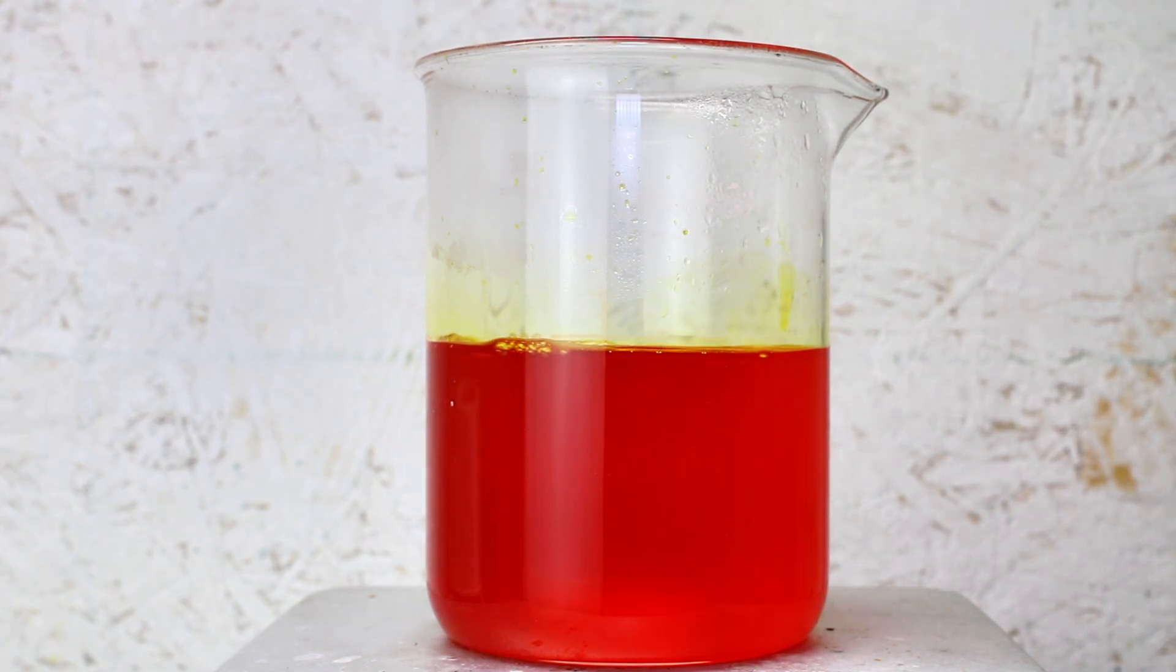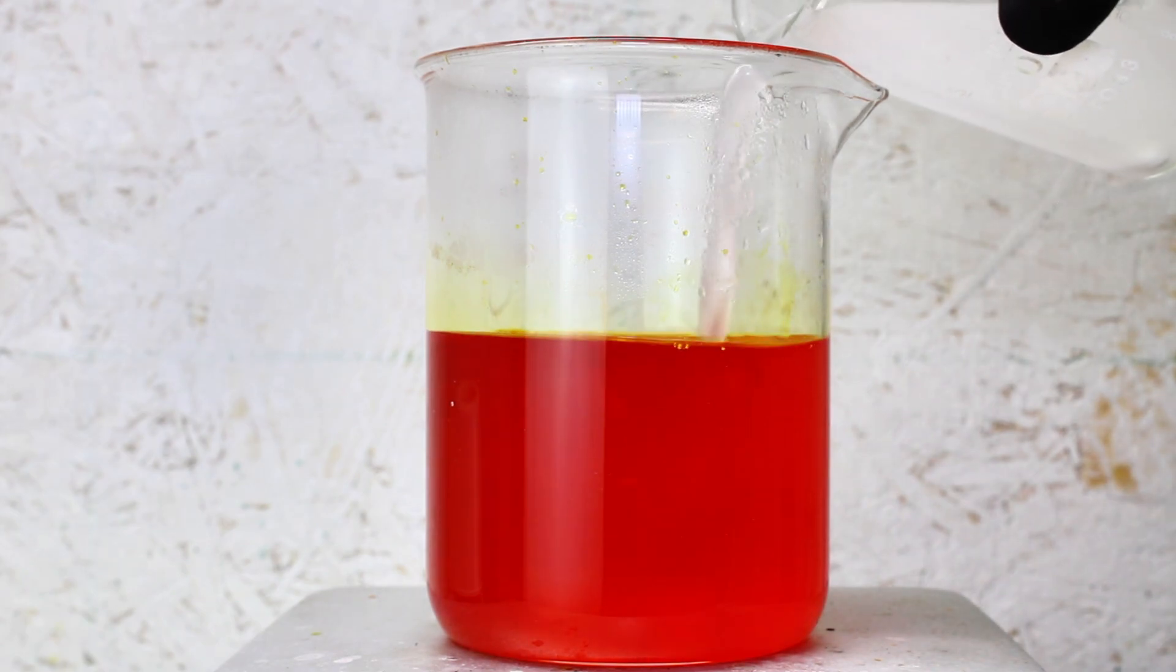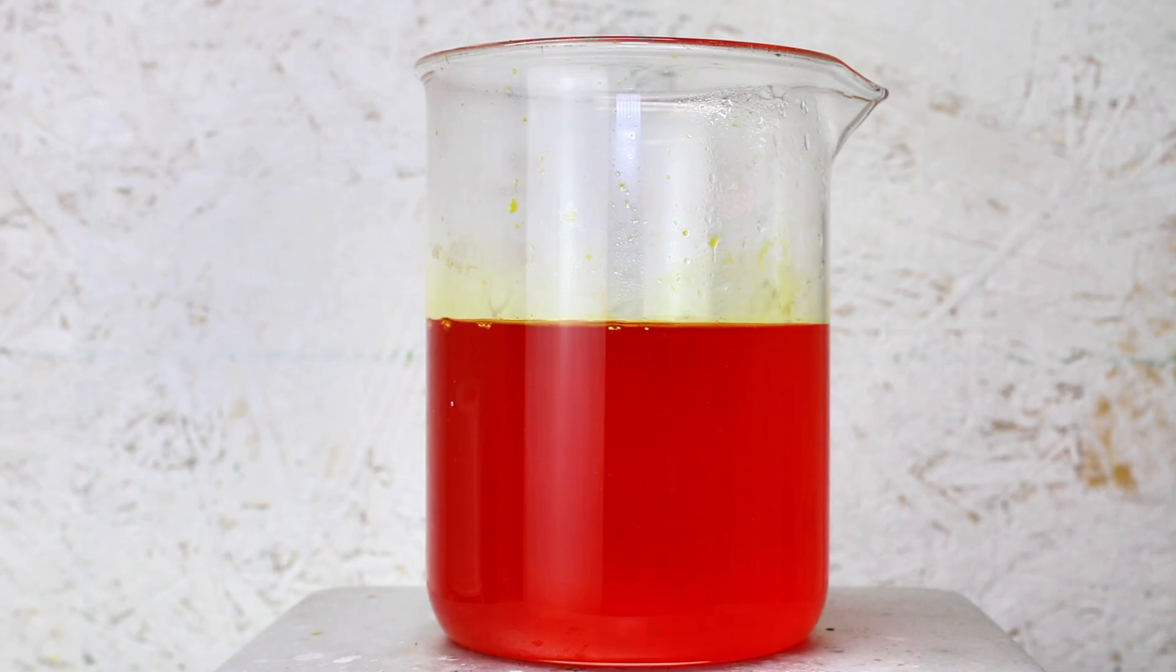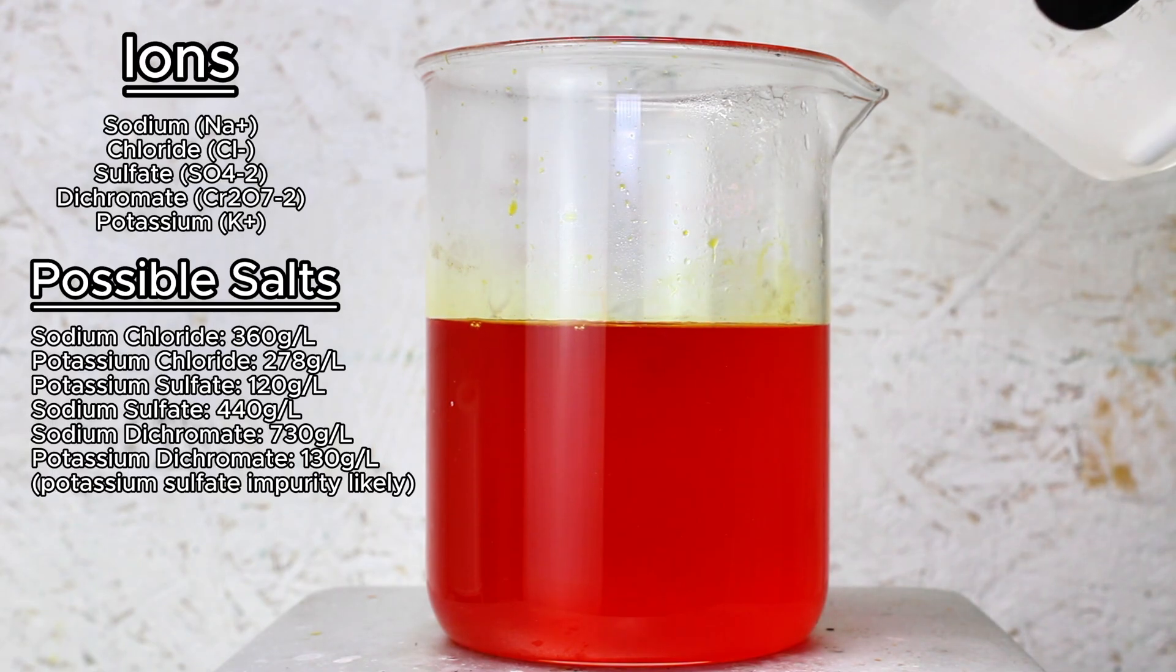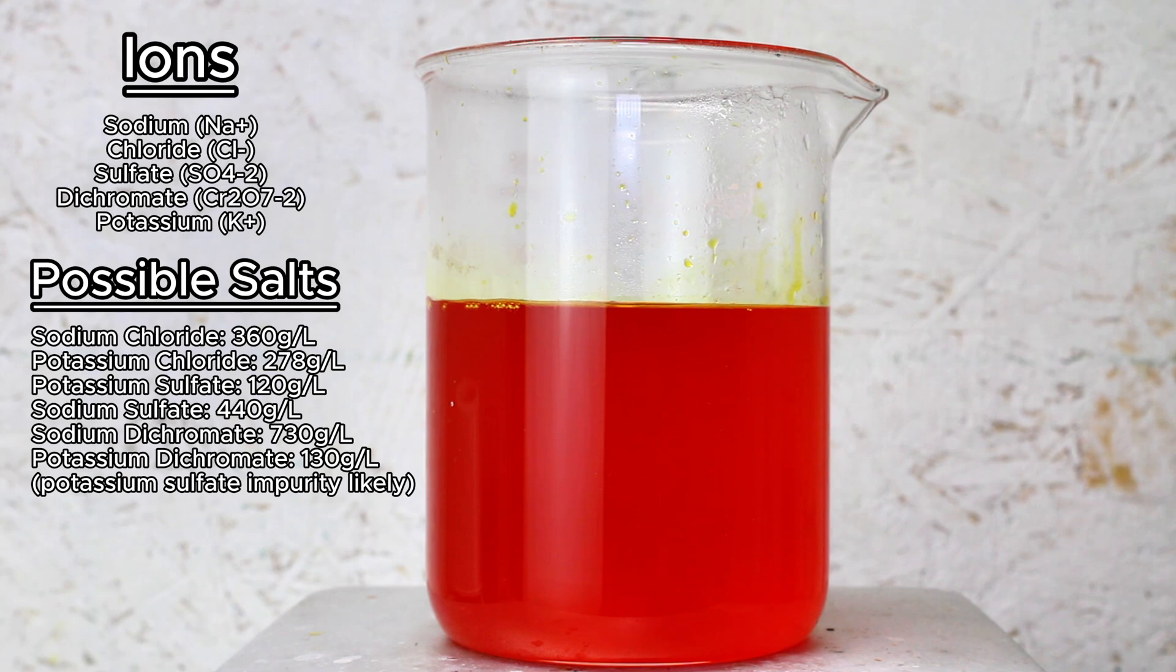Potassium dichromate can be selectively precipitated from solution here because as of right now, the ions floating around in solution include sodium and chloride from the bleach, potassium and chloride from the potassium chloride, a bit of sulfate and dichromate. And of the salts that can form, potassium dichromate has by far the lowest solubility.